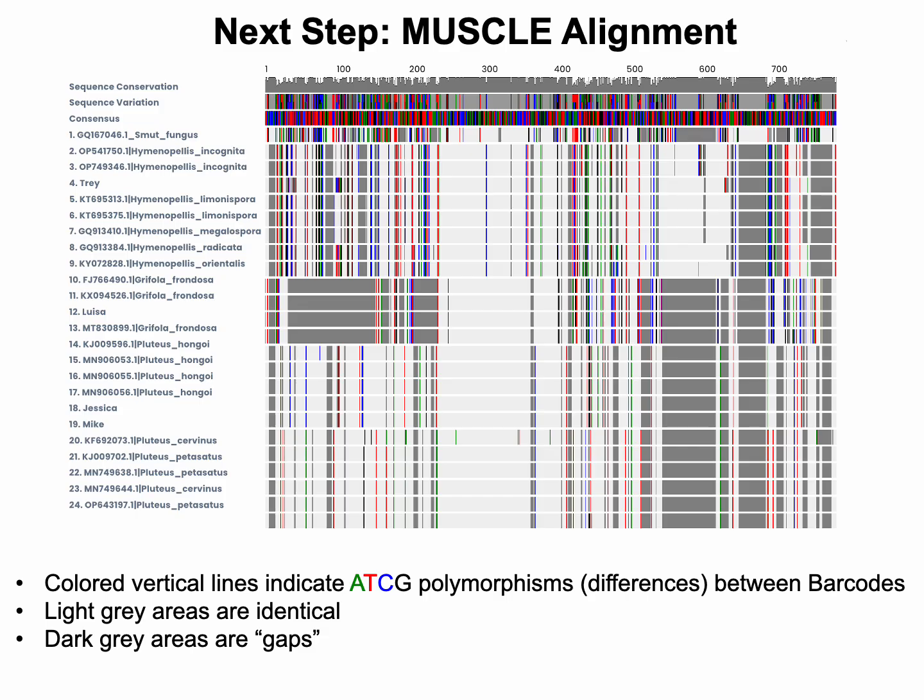The third row down, labeled consensus, shows you the most common nucleotide at each position in the sequence. For instance, if you align 5 sequences and the nucleotides at position 20 are A, T, A, A, and G, then the consensus sequence should have an A at position 20 because A is the most common nucleotide at that position. All sequences, unknown, reference, and close matches, are being compared to each other. The consensus row doesn't really need to be understood in detail, but it represents the nucleotide that matches in all sequences where a polymorphism or colored line is not shown.